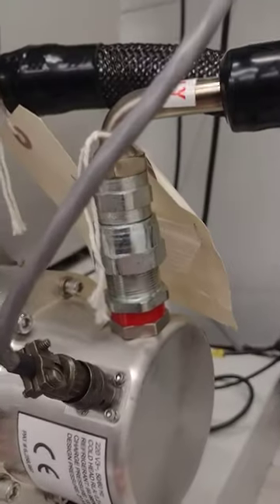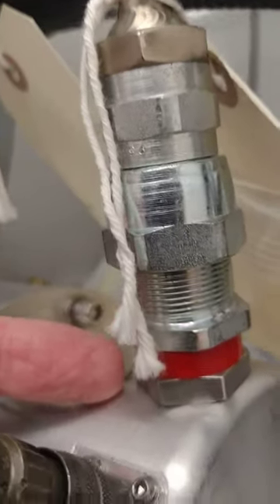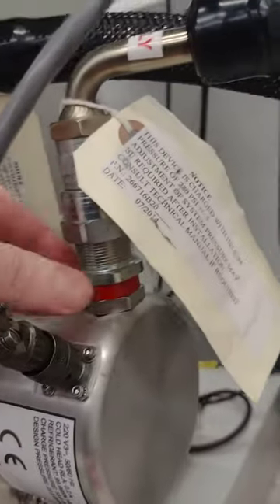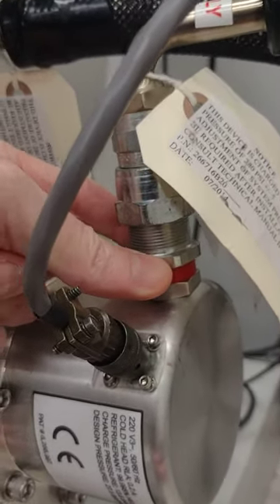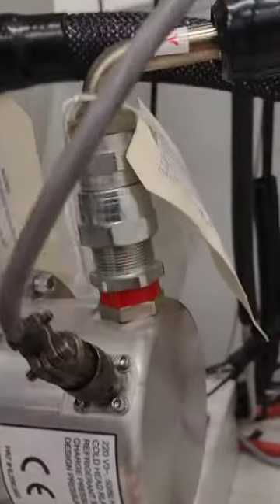The very first step is to put the 1 and 3/16" wrench on here, and then put the 1 and 1/8" wrench on this part right here — not that part, this part. You're going to use the 1 and 1/8" wrench to hold this nut still while you turn this nut off. Because it's a right-handed thread, you're going to turn it off this way.